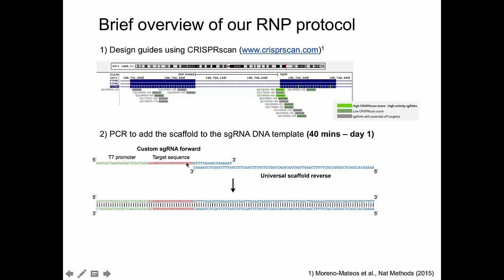Now, normally, and I'll talk about some of the workflow when you're targeting a gene later, but normally when we have a new gene we want to target, in this case, let's say PTPRC, which encodes for CD45, a cell surface receptor, we will design a number of guides per exon, and we might target 3 or 4 exons as a first trial. You can easily make 10, 20 guides in a short amount of time, and actually scaling it up to 20, 30 versus doing 1 to 5 is not that difficult. So once you've finished your overlap PCR, you now have a double-stranded DNA template, and this is the template that's used for in vitro transcription.